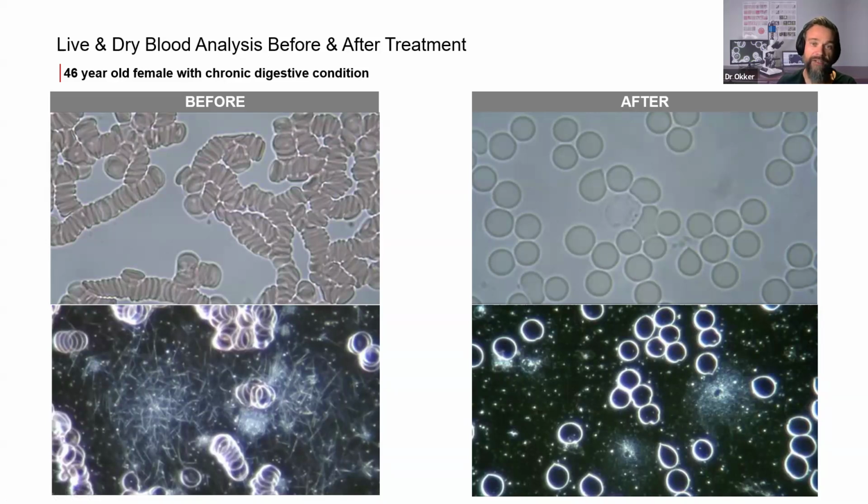It is related to the diet and digestive health. As we know, in natural medicine, many conditions actually originate from the digestive system. It really is a key factor in the development of chronic diseases. And yeah, the overlapping of the cells here, called rouleaux, is mainly related to digestive imbalance, and in most cases in practice also dietary choices. So mainly caused by diet and can be helped through diet, yes?